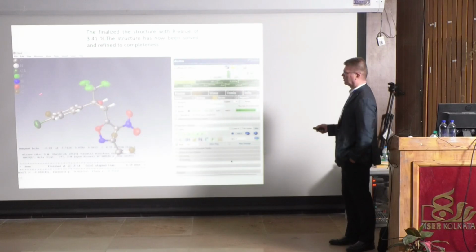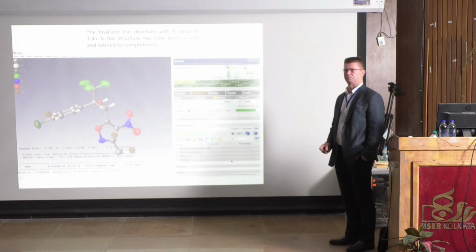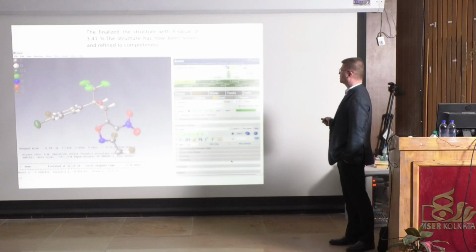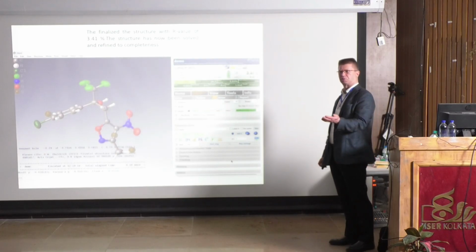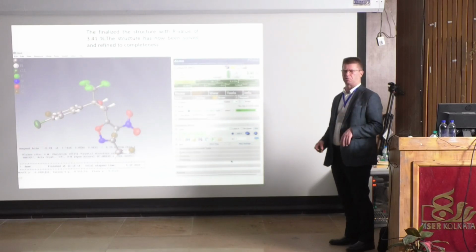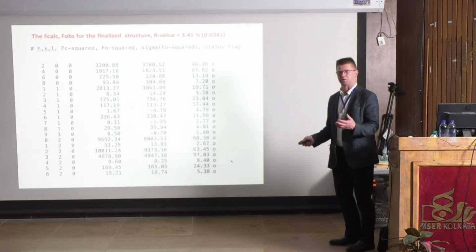And now we know that this molecule is enantiomerically pure and of correct handedness. And this is really important. There are values in here, and when this number is in green, then we know that we have correct handedness. And it should be 0. If it's 1, then it's incorrect. And that's the idea. This is what the outcome is.